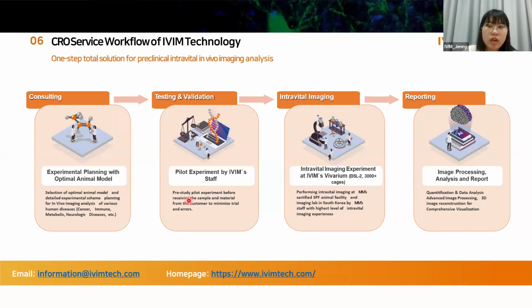Next, we carry out a preliminary feasibility test. This test is essential for confirming whether the proposed experimental design can be successfully implemented and whether it will produce reliable, high-quality data. By validating the methodology at this stage, we help prevent costly delays or failed experiments later on.